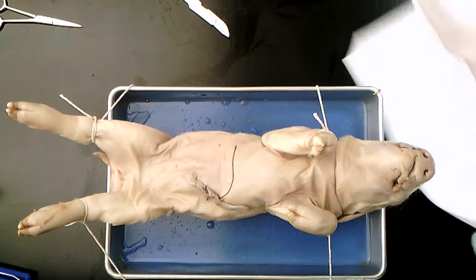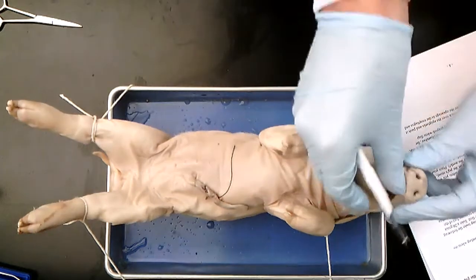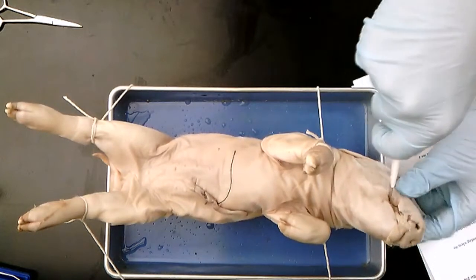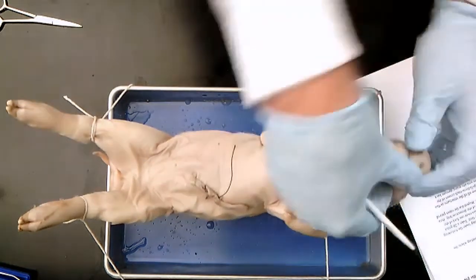So to get started, to dissect the mouth cavity, I'm going to use the scalpel, and I'm going to start by making incisions at the corner of each mouth. Make sure your students watch where they put their finger, because the scalpels are sharp and they'll cut pretty quick.